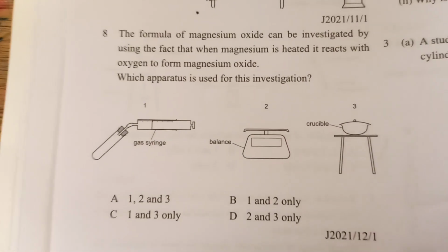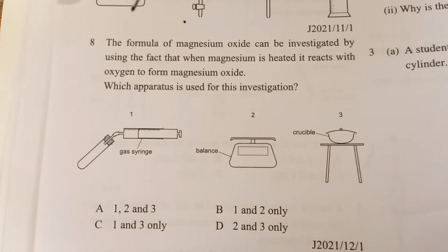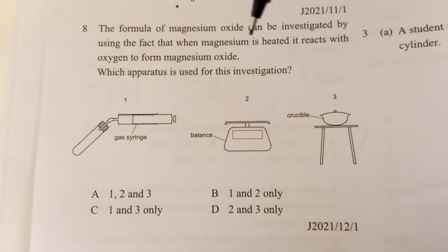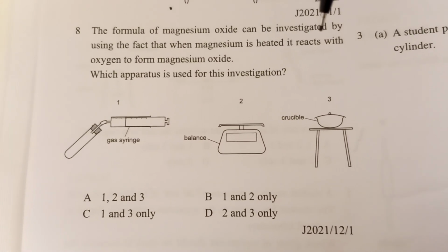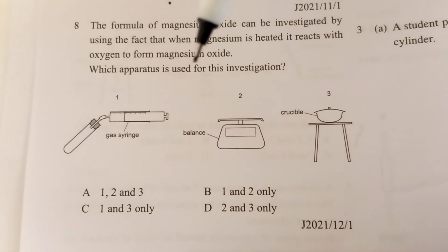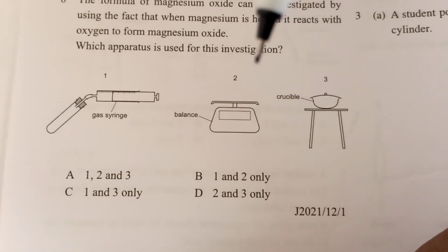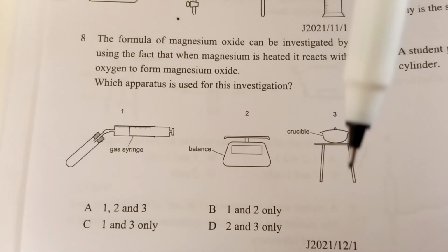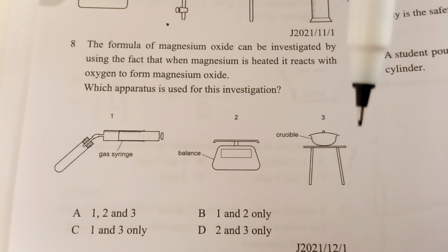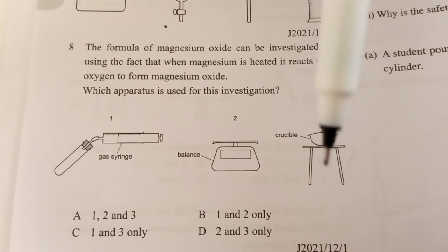Now, stop the video and try this question first. The formula of magnesium oxide can be investigated by heating magnesium in air to form magnesium oxide. Which apparatus is used to investigate this? Now, we have to weigh the crucible, the lid, and the magnesium powder.